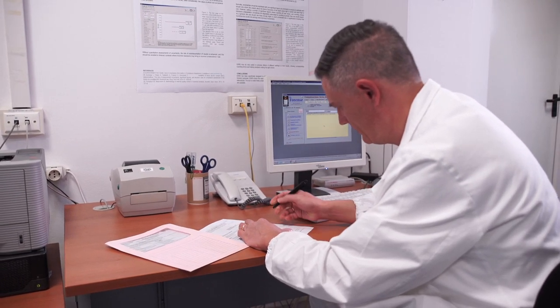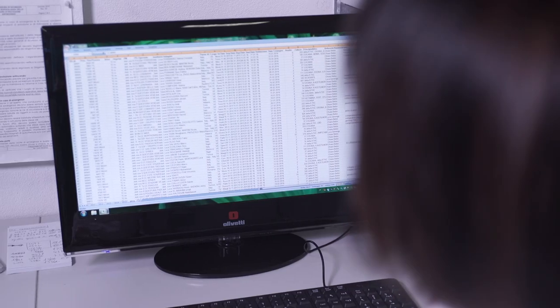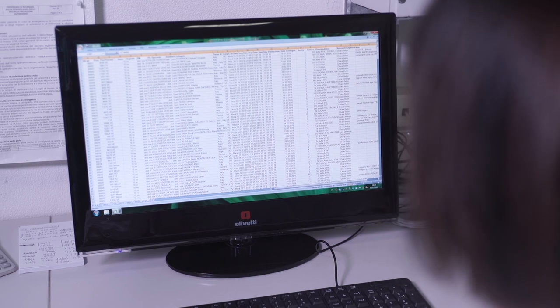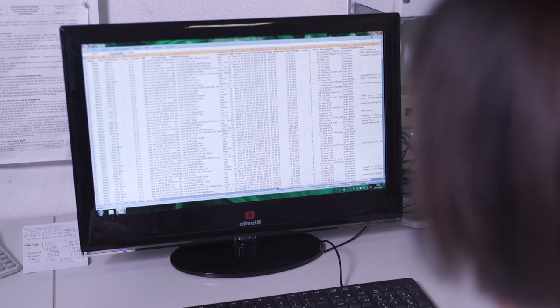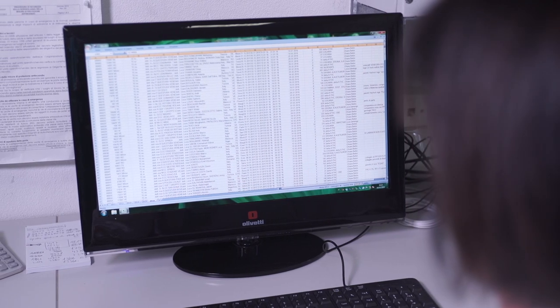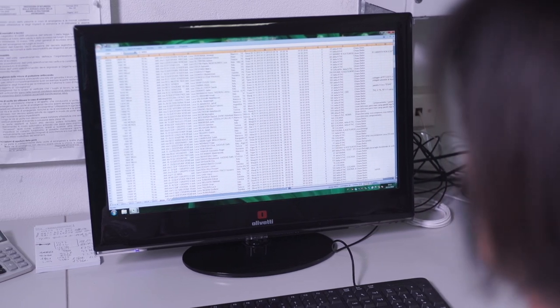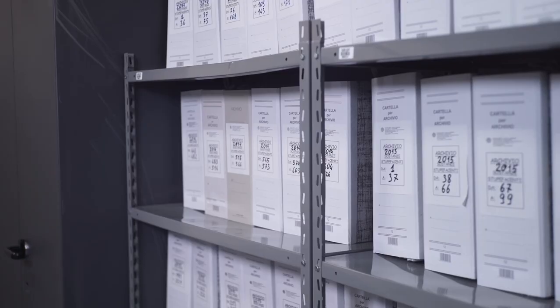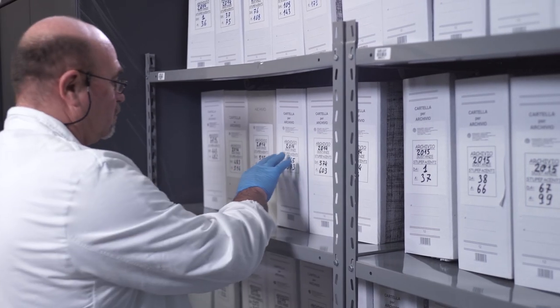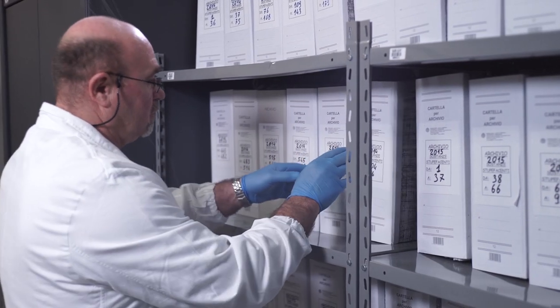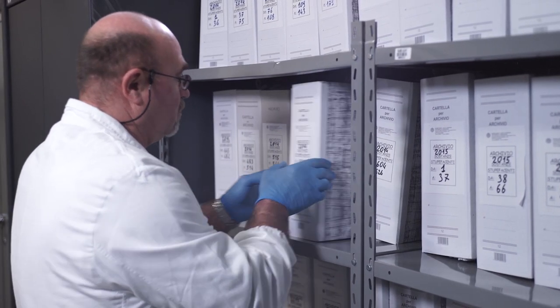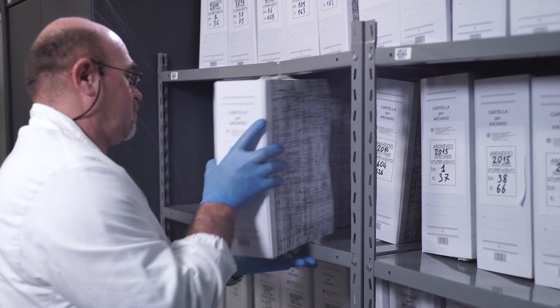Because law enforcement may request further investigation and presentation of information in court, all data concerning the forensic analyses are archived and secured. With HRAM and full scan capabilities that capture all sample data all the time, retrospective data analysis can be performed without repeating experiments.